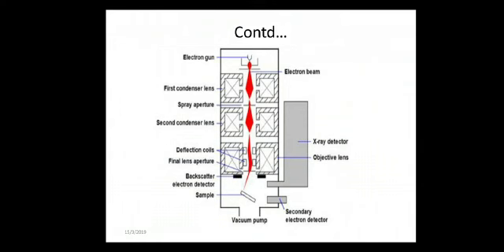Yes, and we have some disadvantages in the case of scanning electron microscopy also. Scanning electron microscopes are a little expensive. The cost will be nearly a crore, like 30 lakhs, 40 lakhs, depending on the various machines. The cost is higher, and the size of the scanning electron microscope is large, and we require a separate area, which should be free from possibilities like electric field, magnetic field, and vibration interference.